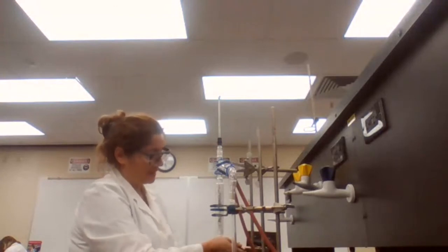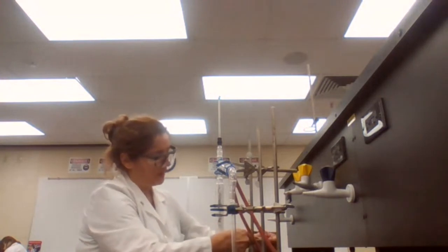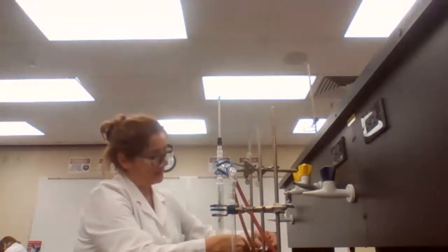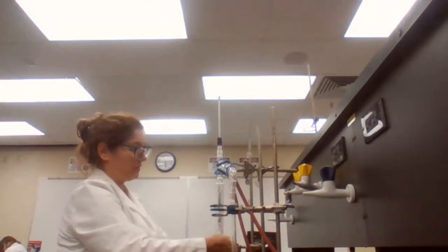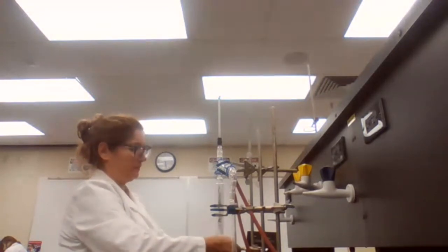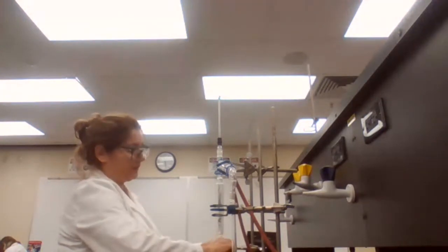That clamp, the cap clamp, is going to actually help, but we still have to use a utility clamp to secure it, to make sure that it is secure.